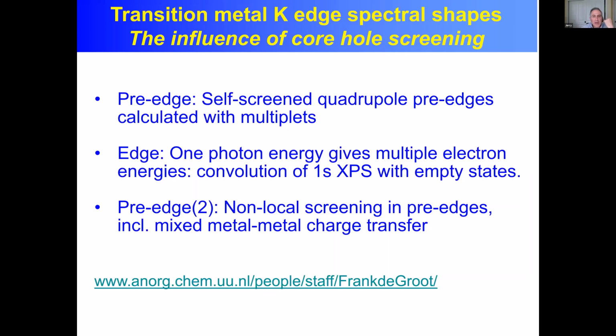Okay, very good. Neri, you had a question about HERFD? Yeah, you were showing these HERFD plots earlier, and one thing I noticed, and I've seen this in other papers as well, is the pre-edge XANES and the HERFD overlaid on each other. The HERFD features don't perfectly match in terms of the peak positions. Could you give me some insights on that? Is it due to the slicing of how you do the HERFD, or is there additional physics in the HERFD?